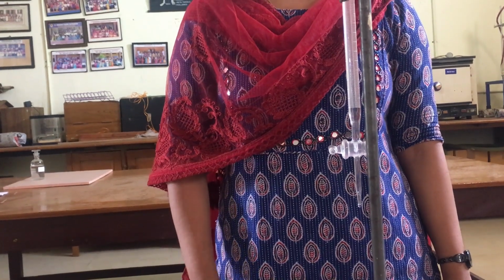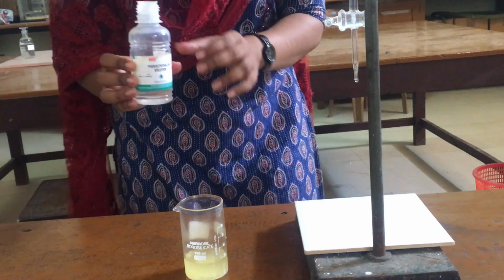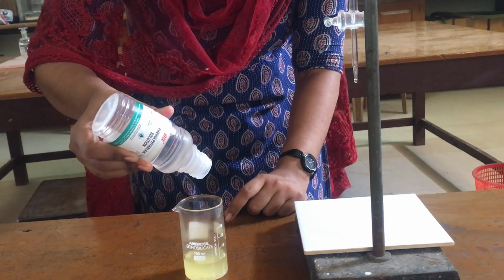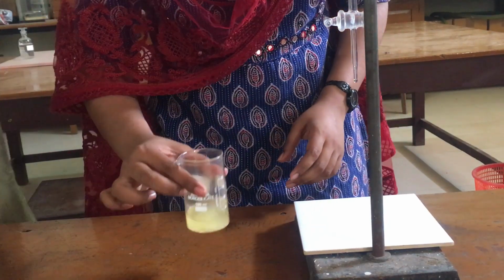The KOH filled in the burette is perfectly clamped, and next we are going to add phenolphthalein indicator solution to the melted butter. About 2 to 3 drops of phenolphthalein indicator we can add to this solution. Then after that we need to swirl it.